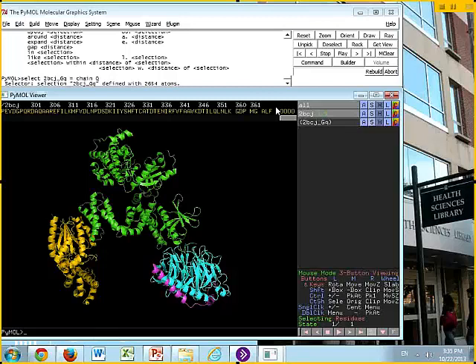So crystallographers can mimic the transition state by binding aluminum fluoride. So that has characteristics of the third phosphate, but the conformation is more like the transition state. So the ALF is aluminum fluoride, and there's a magnesium there. So these are your ligands, and there are some waters there associated with that ligand.